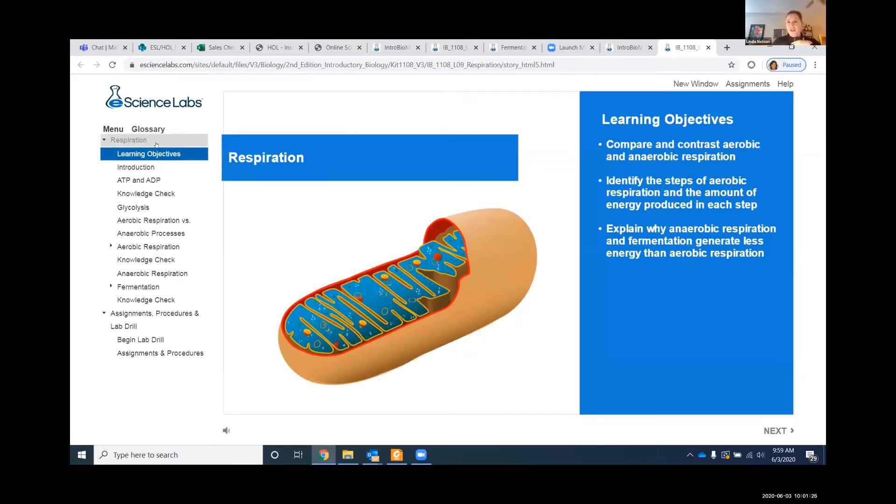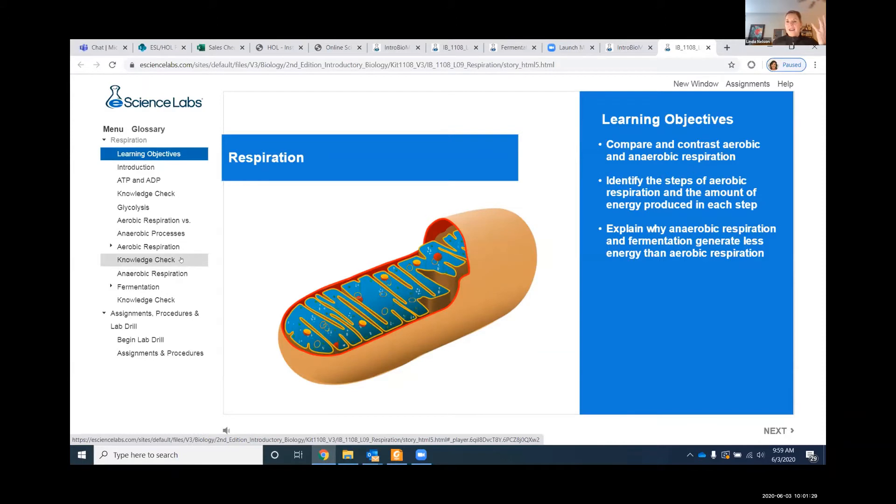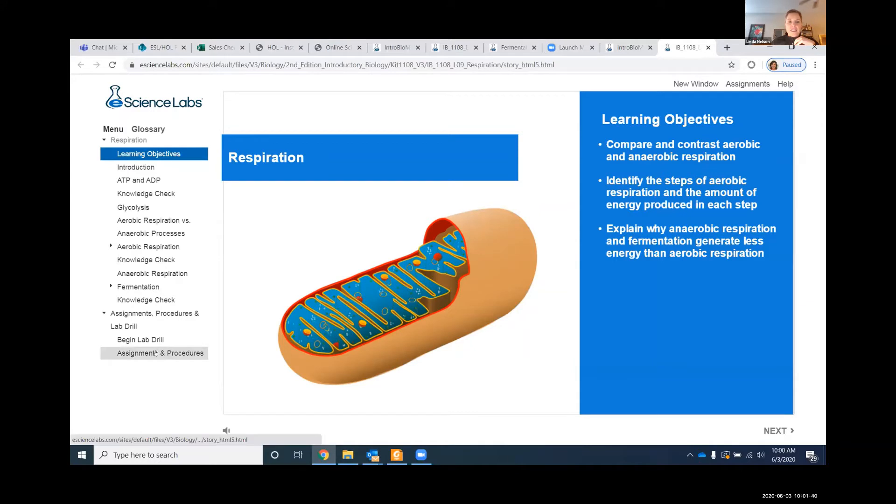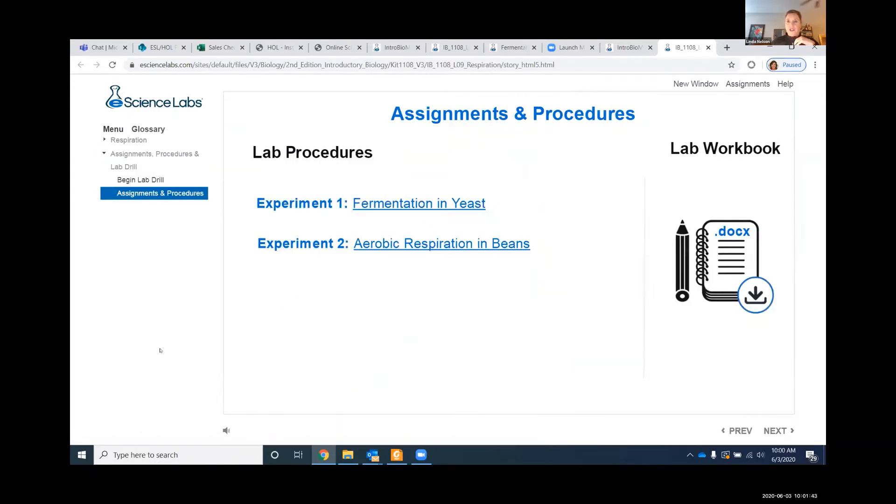Over here on the left is some knowledge checks. This is some bite-sized chunks of information. We hope your students go and view it, but a lot of times they just want to get to the meat of the experiment, and that's going to be down here in the assignments and procedures. Once you click into that assignment and procedures, now we're going to open up and see those experiments.